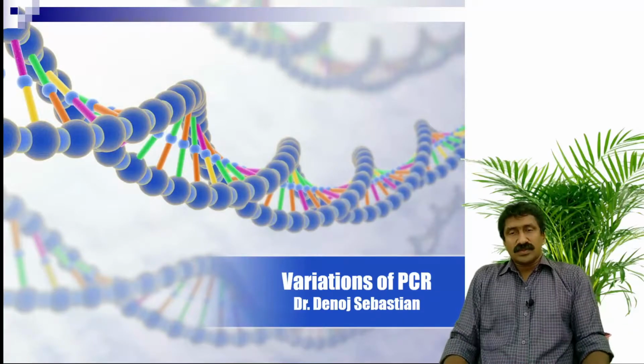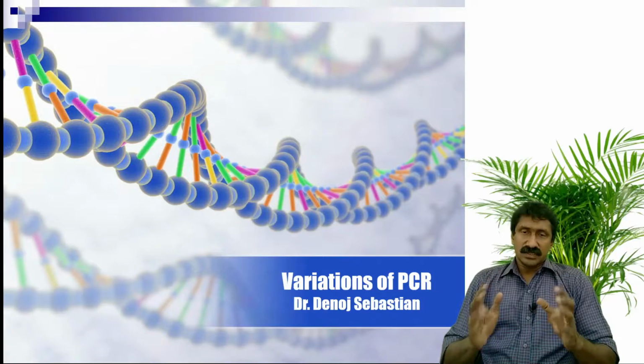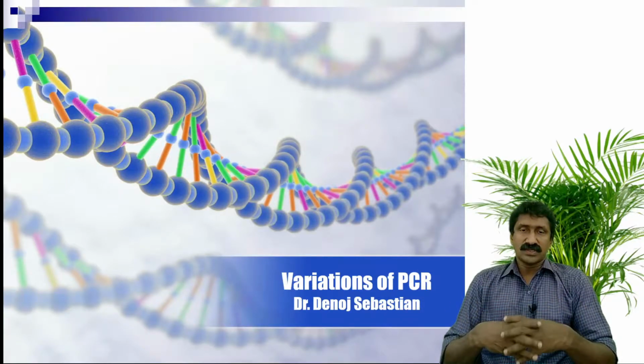Today we are going to discuss variations of PCR. In the previous sessions we already learned the concept of the PCR and the concept of the primer design, etc.